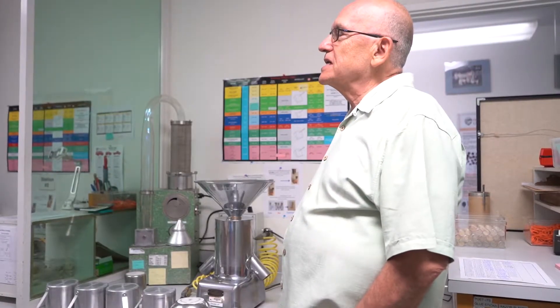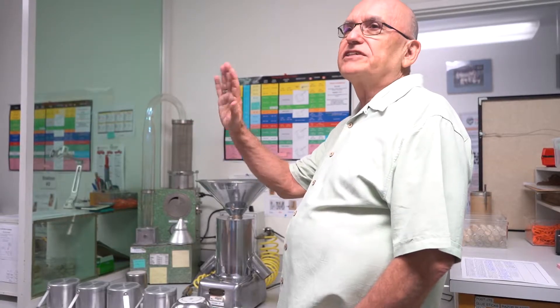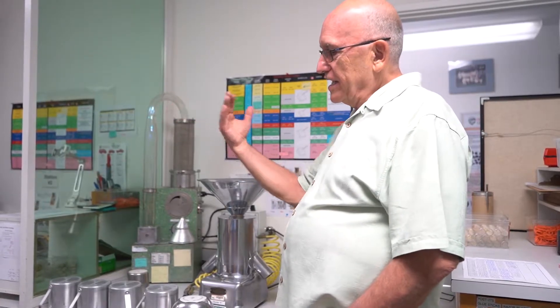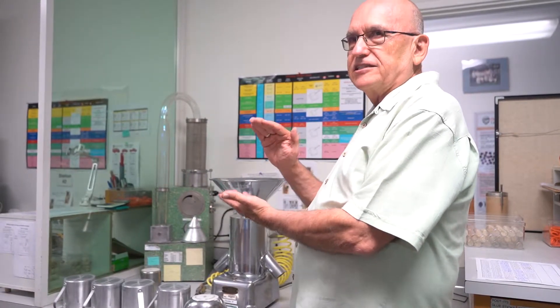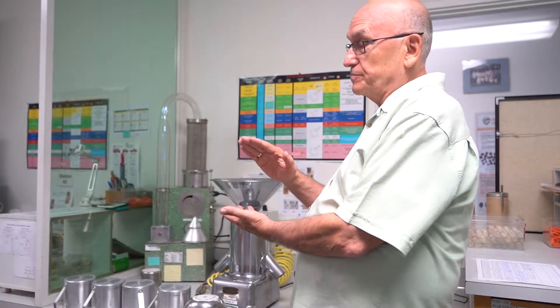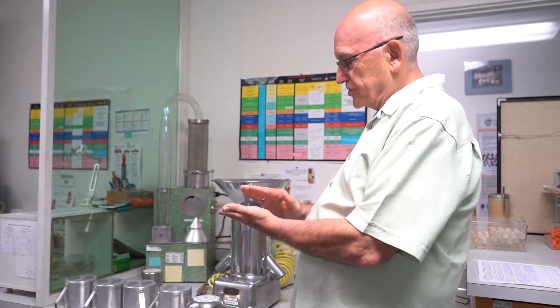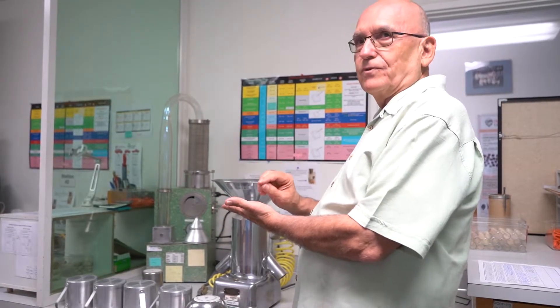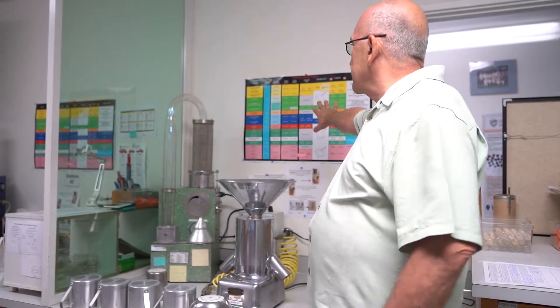When we take samples, the sample is representative of the field, of the seedlot. We receive the sample here and it'll be a pound or two, and that's supposed to represent the 55,000 pounds. In this room, we're going to divide it down to smaller and smaller portions that need to be equal, and the amount in each proportion is on this chart here.